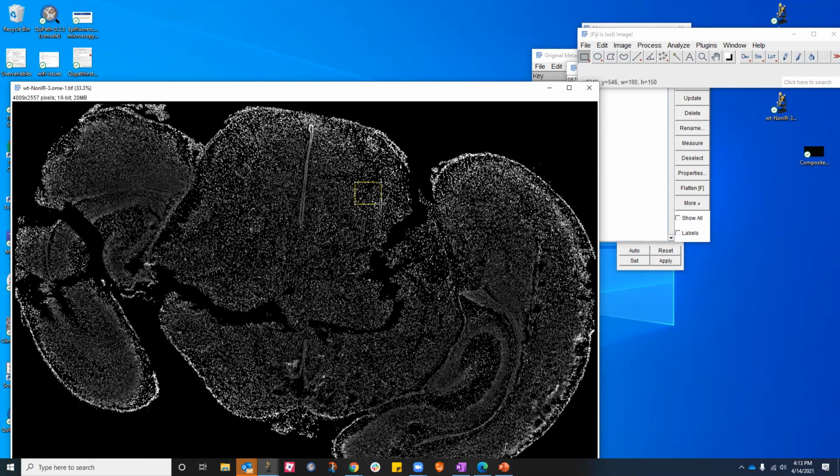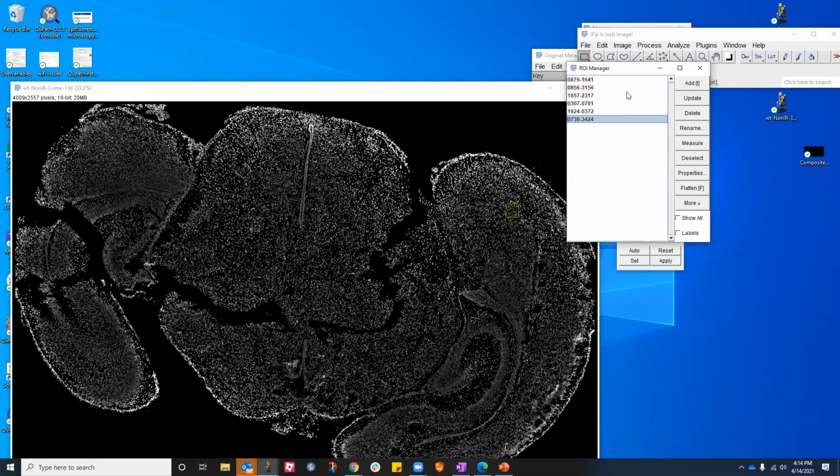But trying to get 180 by 150 all the time or using some of the other options is really painful, right? So if I just draw this and say, let me just delete all this, guys.